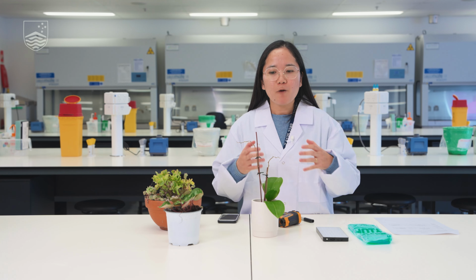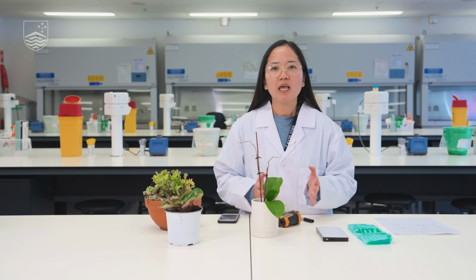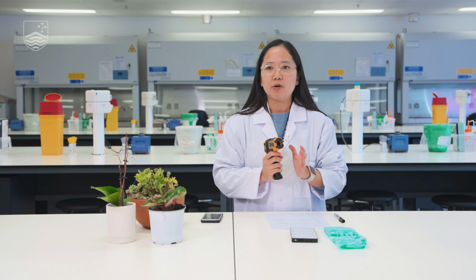So why is it important that we know what time it will take for a particular plant to go back to its baseline temperature? When plants experience climate change, there are plants that are more susceptible and more tolerant to those changes in temperature. And so by doing this experiment, we will have an idea which plants are better suited to be grown in those areas that are more prone to drought or hot conditions, and which plants are more tolerant or suited to grow in winter conditions. What we will do, we will first measure their ground state or their normal temperature of the leaf.